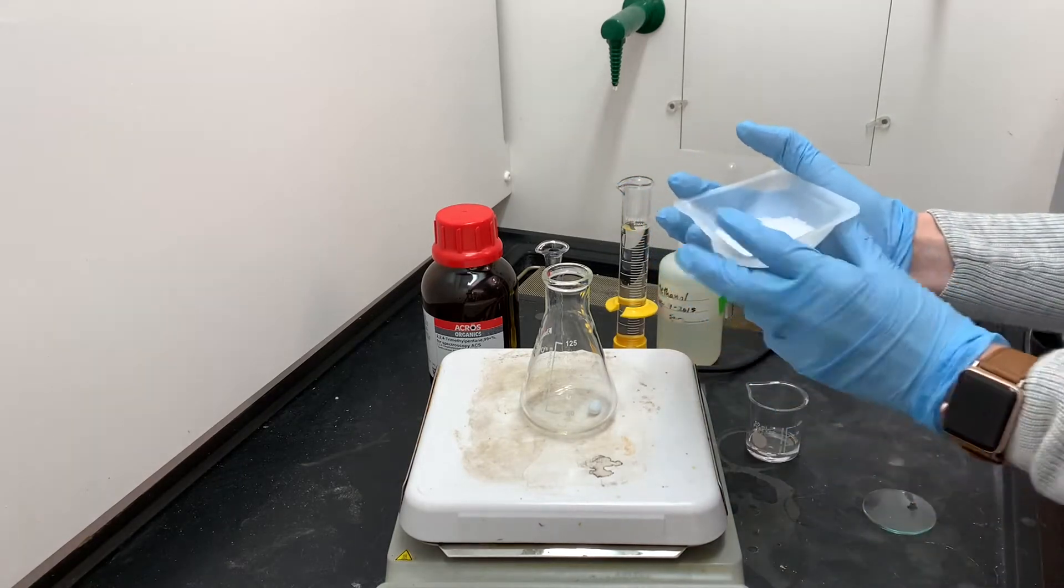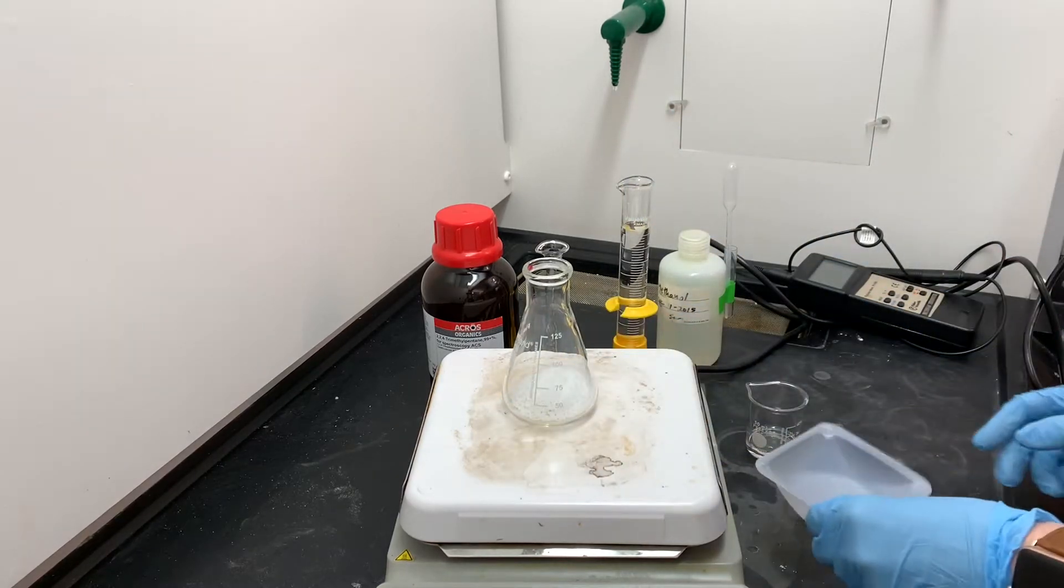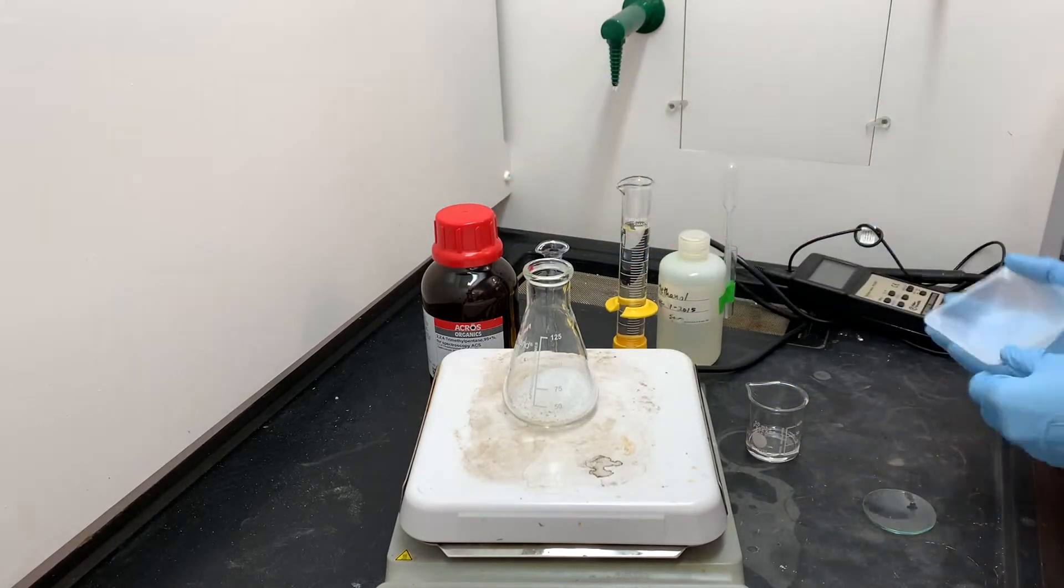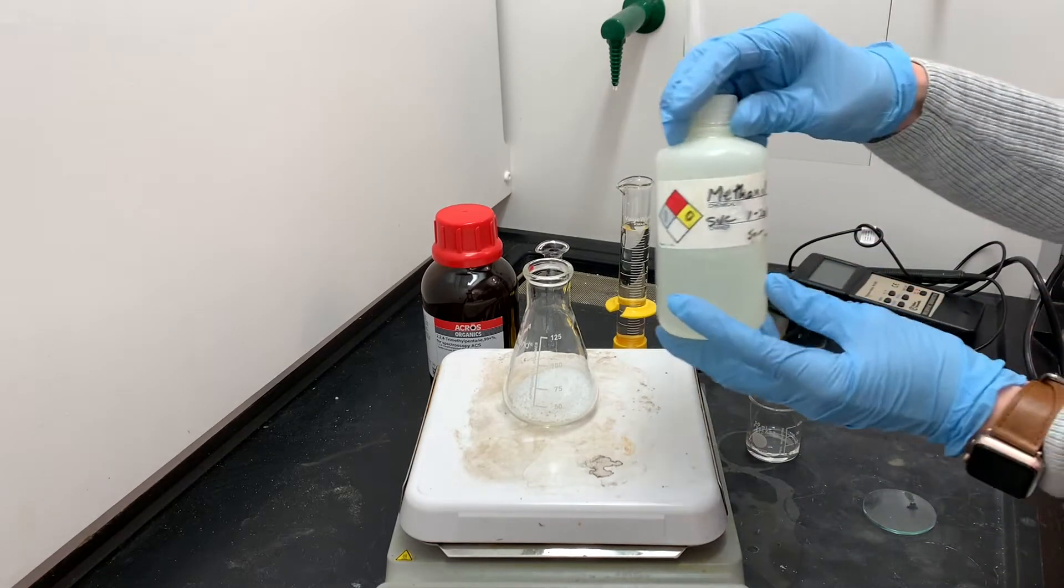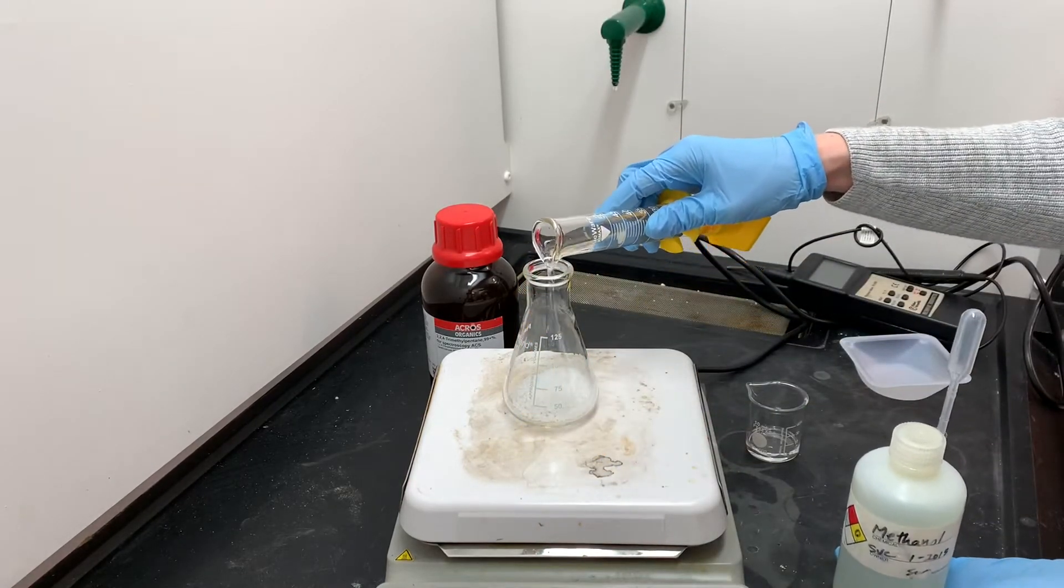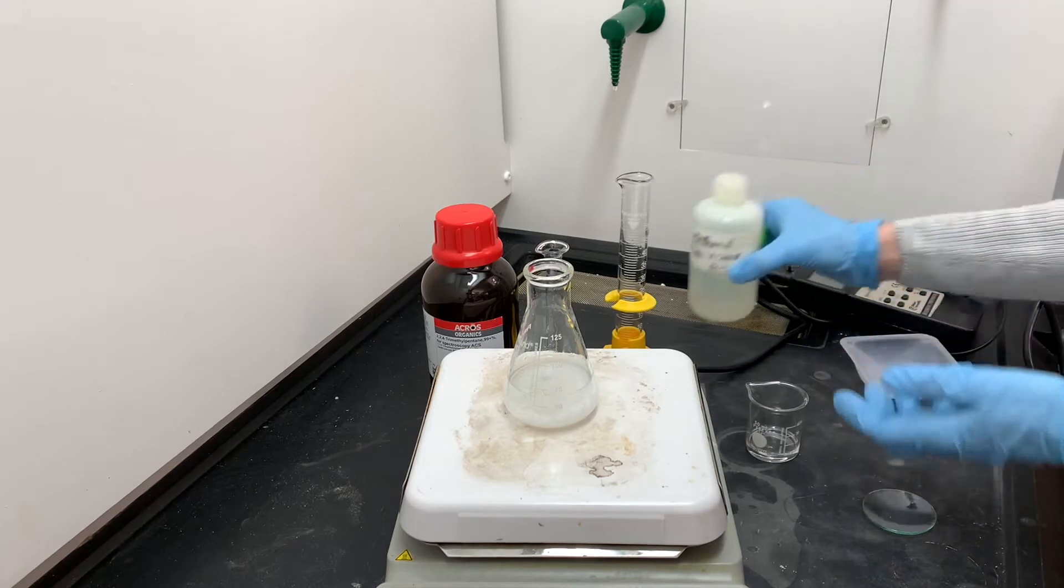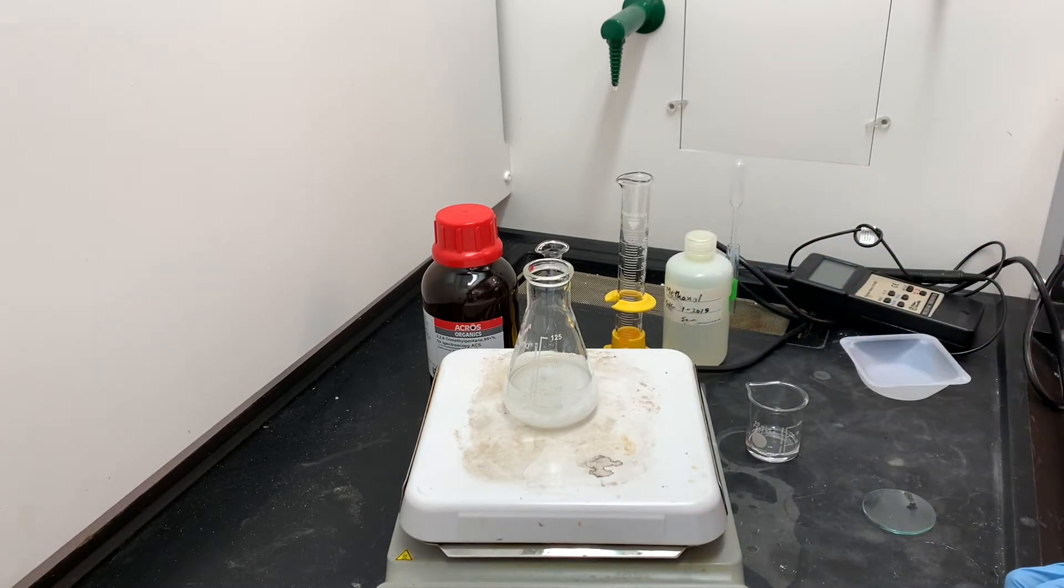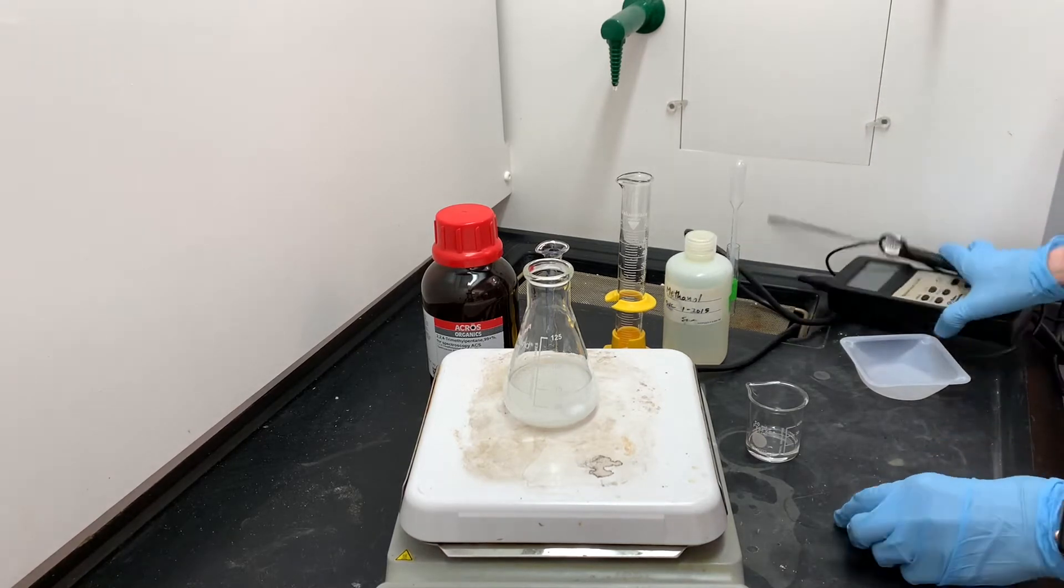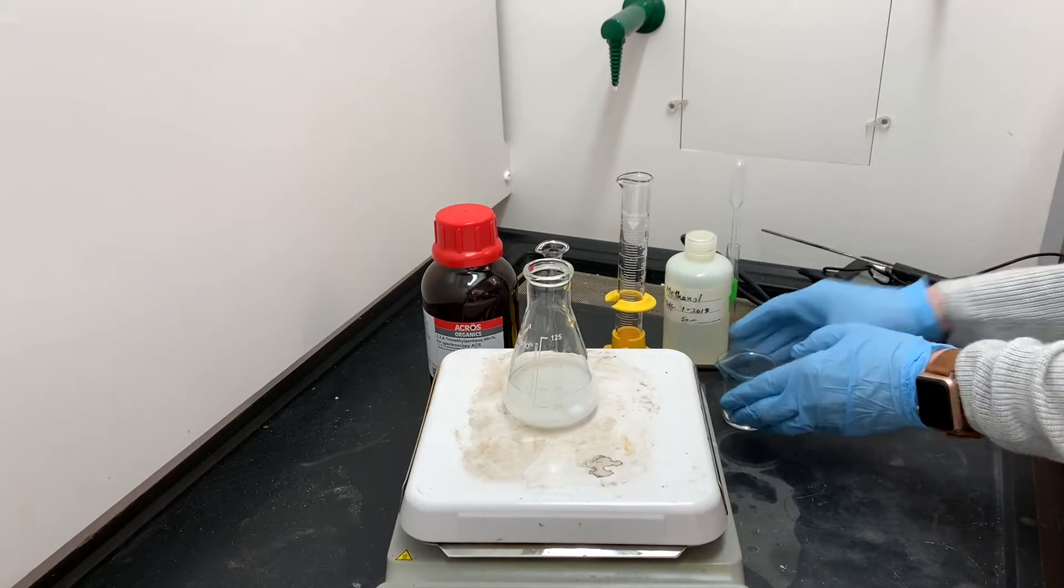Here's all the urea that I measured out. I'm going to be using this Erlenmeyer flask to dissolve the urea. It's really important that I get the urea completely dissolved before I add that mixture of alkanes. I'm going to be using methanol to dissolve the urea, 50 milliliters. The urea is not going to dissolve easily in this methanol, so I'm going to have to help it dissolve. First, I'm going to be using the stirrer on the hot plate, and I'm going to be gently heating the solution to help it dissolve. I'm going to cover up this mixture of alkanes so that none of them evaporate while we're getting this urea dissolved.